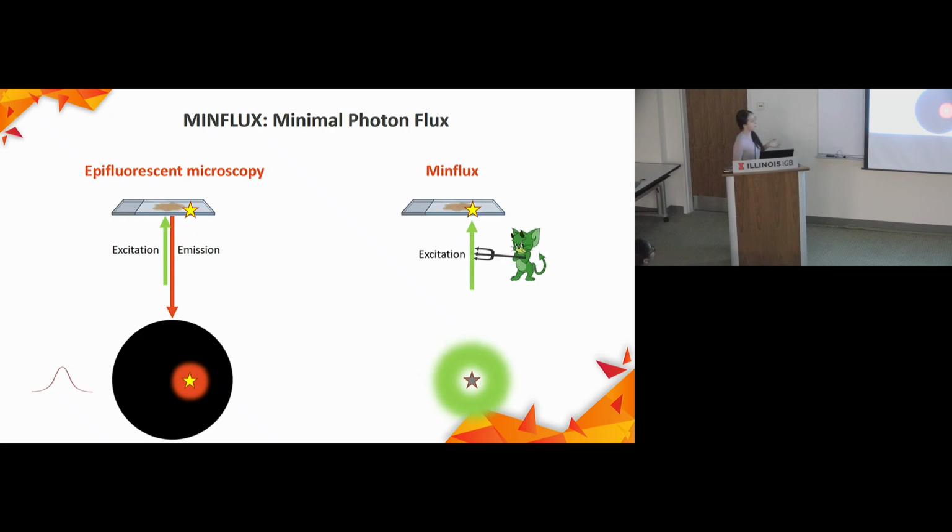Okay, so let's look at this. The molecule is moving, the demon is moving, the laser is moving, and by telling how much your laser is moving, you can tell how much your molecule is moving, because the demon makes the laser move with the molecule all the time.